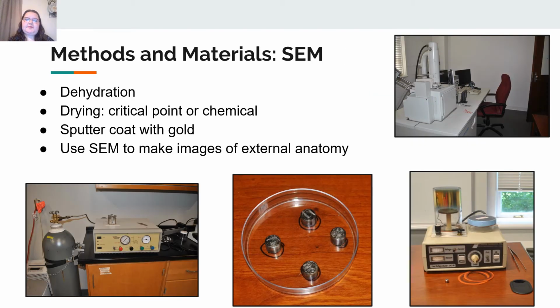So the first set of pups underwent scanning electron micrography, and the first step of this process is dehydration. This just removes any water from the embryo and allows critical point drying to happen a lot quicker. And this is the setup for the critical point dryer.